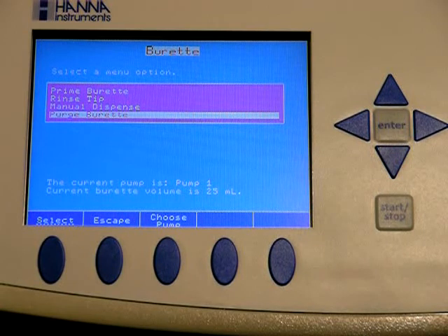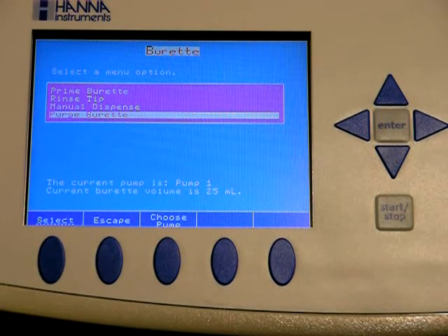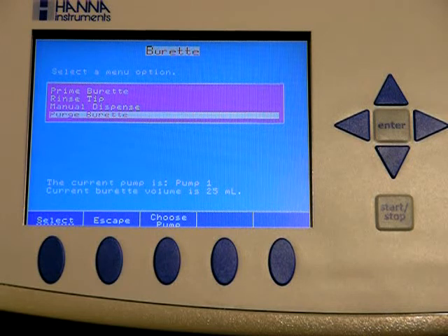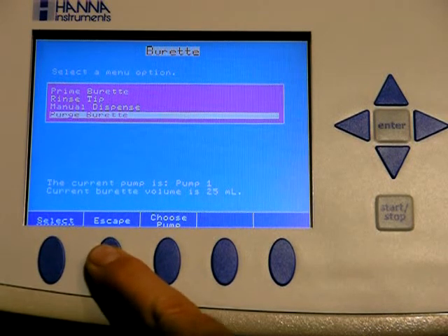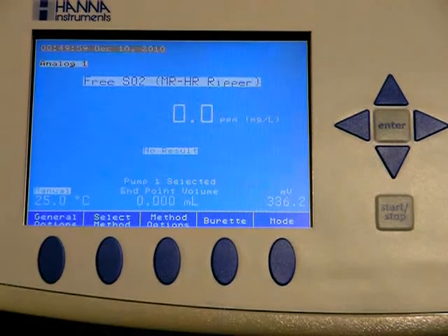And then finally, purge burette. This is when you are purging out one reagent, getting ready to do a rinse and a change to another reagent.